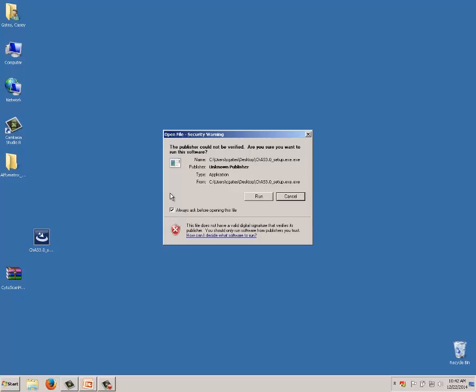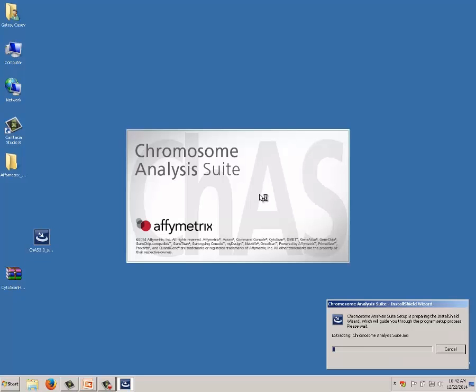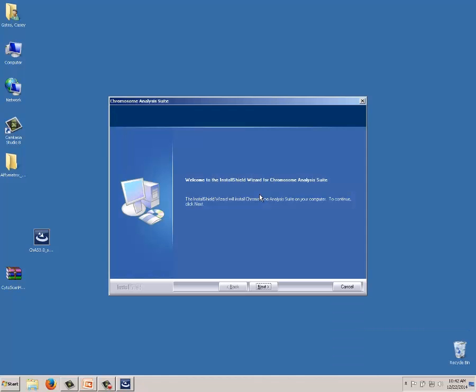It asks whether I want to run the executable — yes. It will ask a series of questions about the database we want to install and where. I'm doing a clean workstation installation without any previous CHAS. The typical installation takes about two minutes once we get through the questions. If upgrading from 2.0 or 2.1, it may take longer depending on how many library files need to be copied to the archive folder. We click through the install shield and proceed.